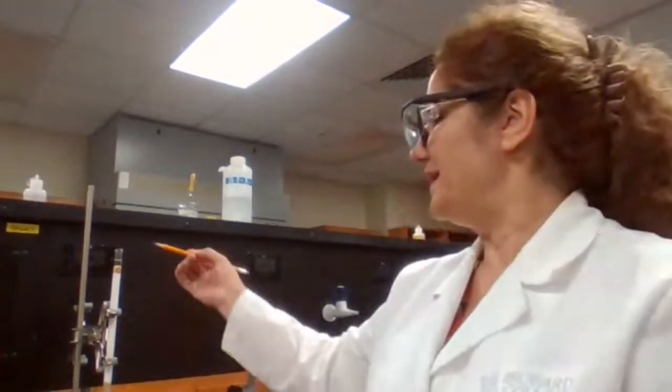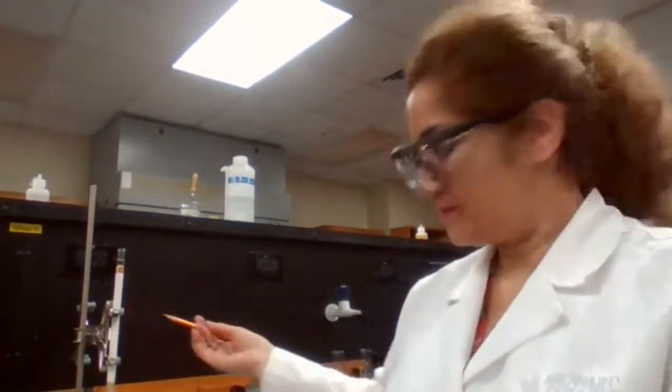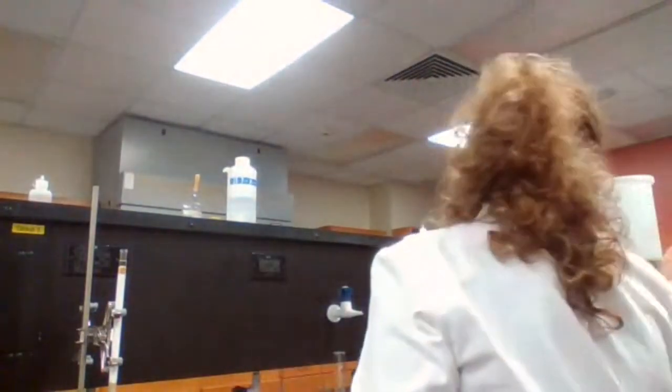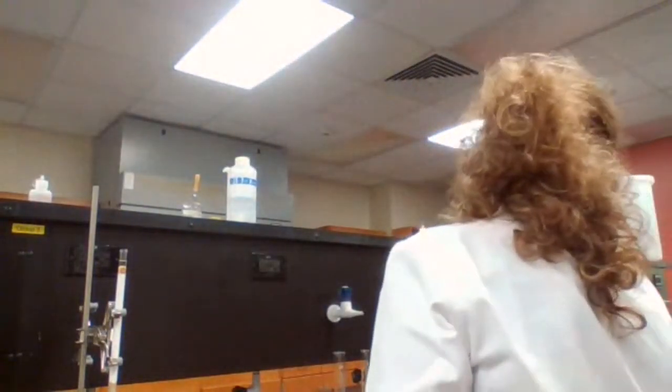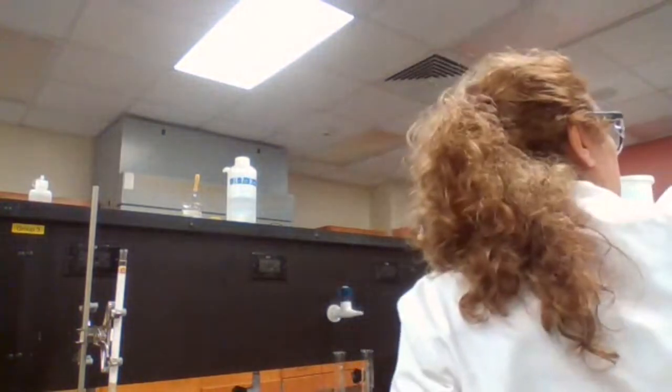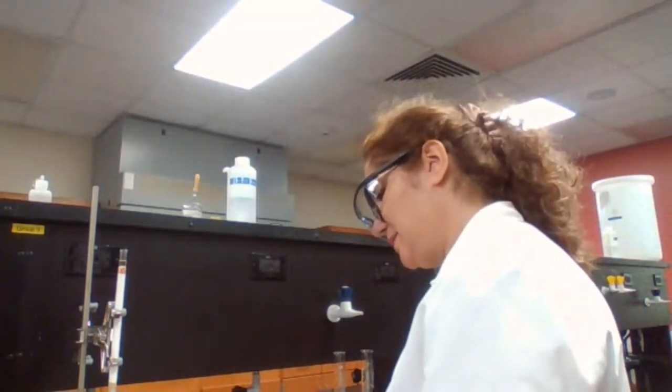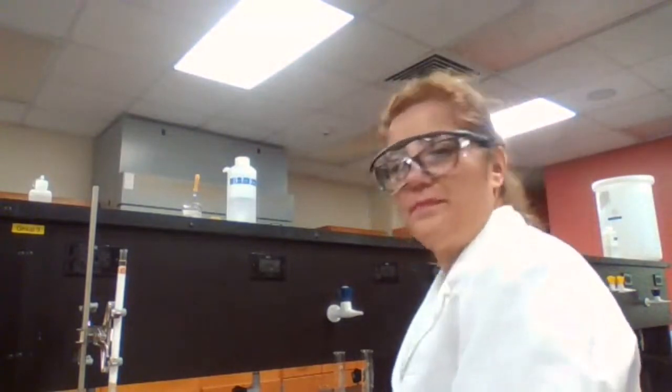So what would be my next step for column chromatography after I prepared the column already? It's usually in that corner and we plug in. What's my next step? 0.2 grams of fluorene mixture.